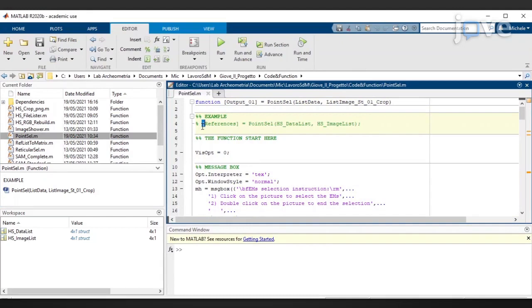Type the command line, including the semicolon, in the terminal window and press Enter to run the code.